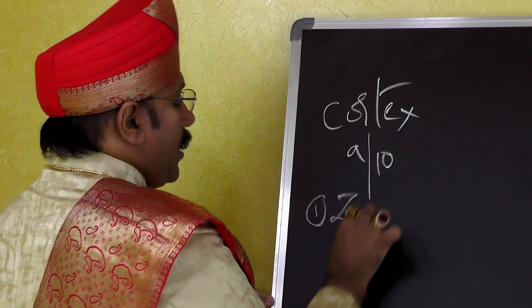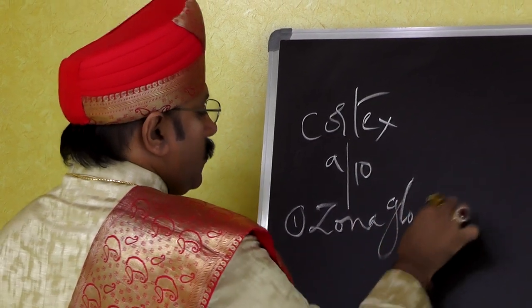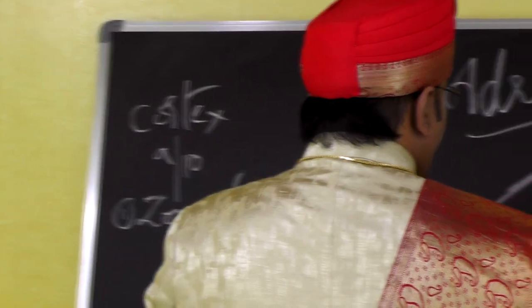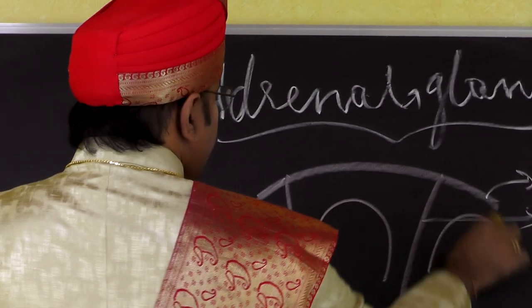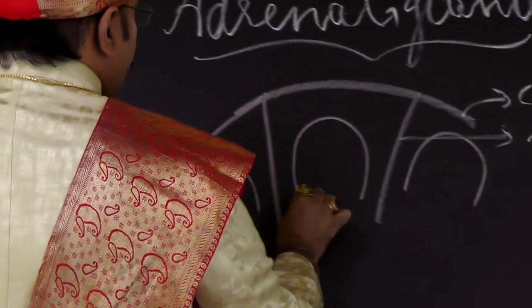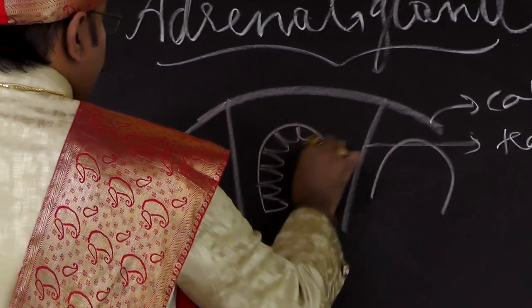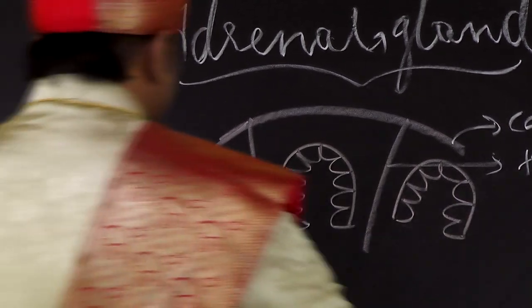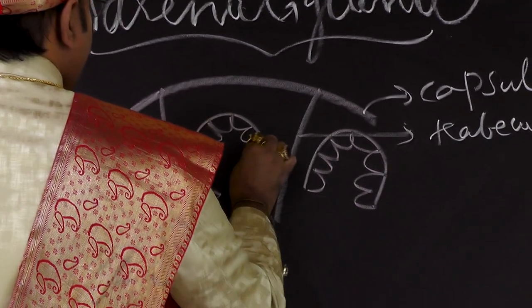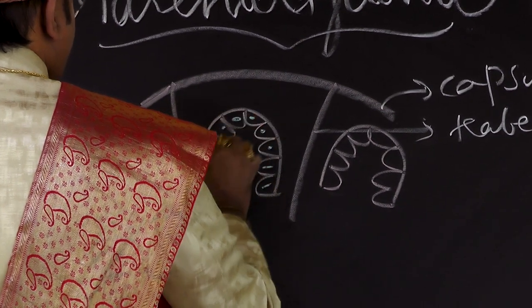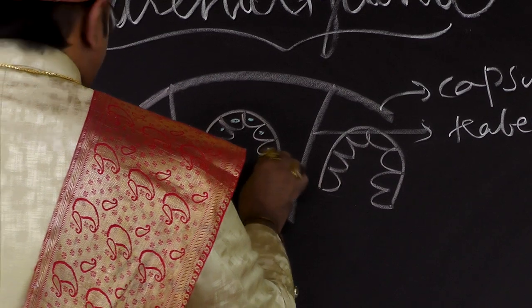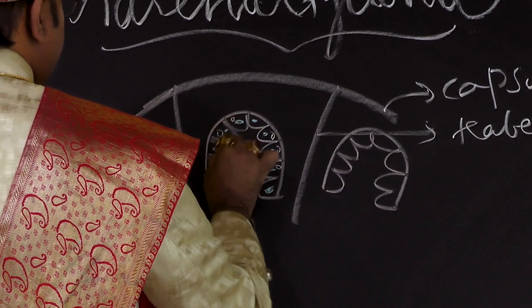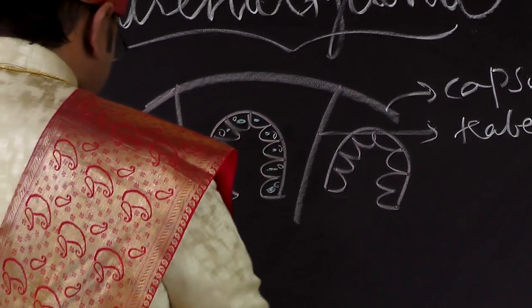The first zone is the zona glomerulosa. It is made up of inverted U-shaped groups of columnar cells. These cells have a deep-stained nucleus and vacuoles are present within them.